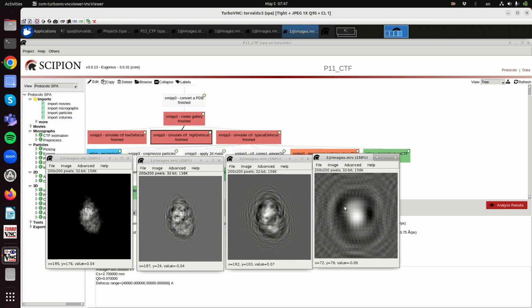So this is the first thing to take into account. The padding must be sufficient so that we don't have nearby cells interfering.